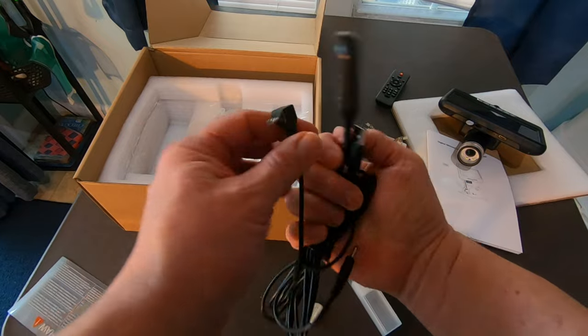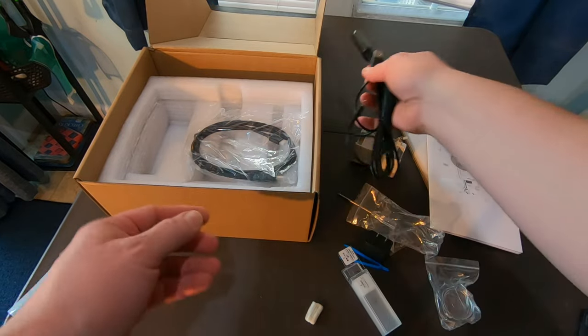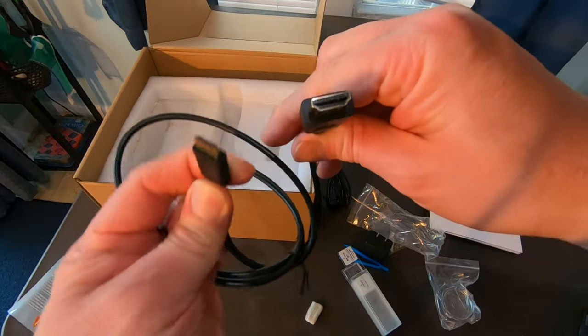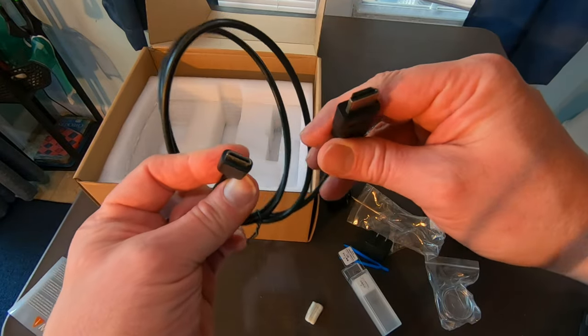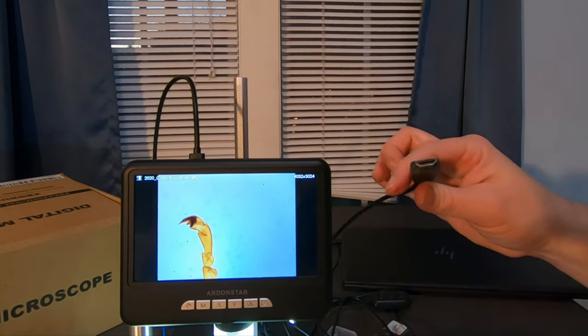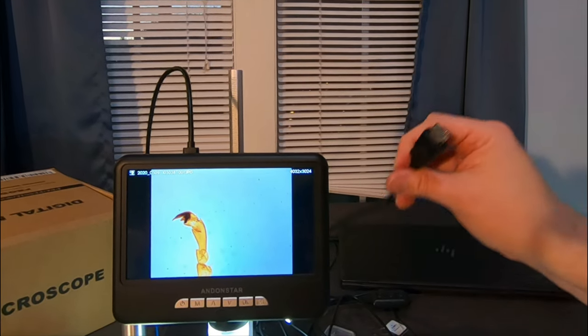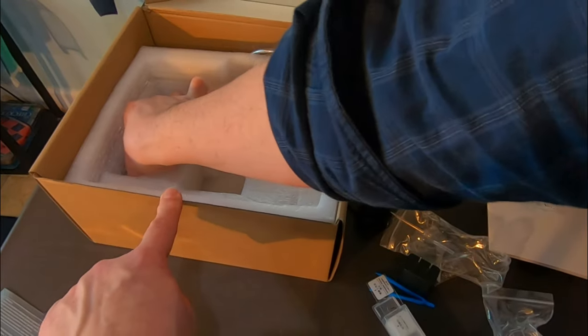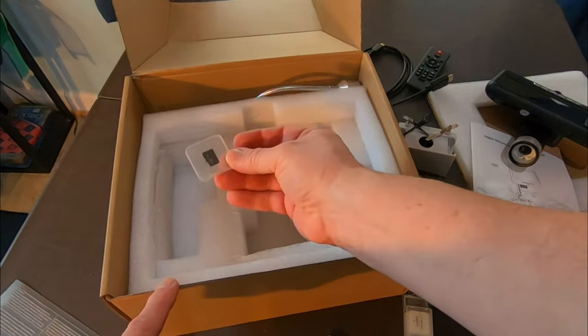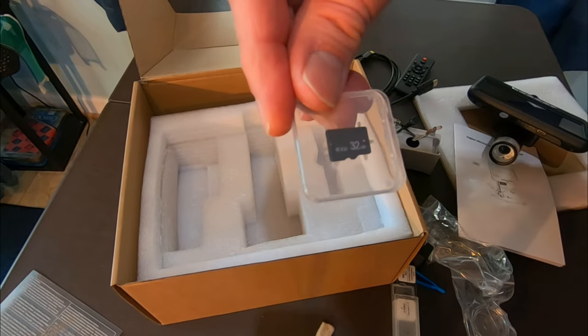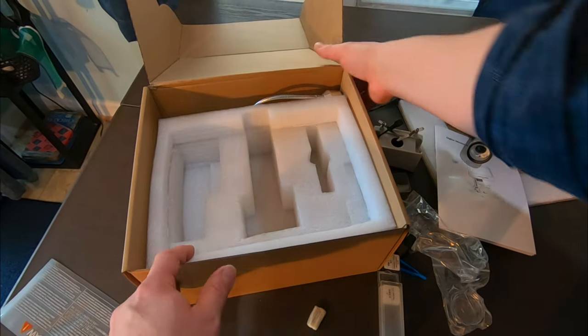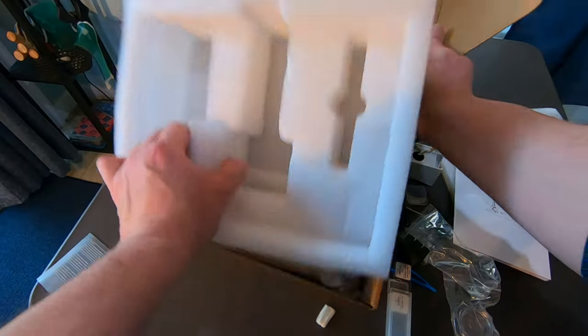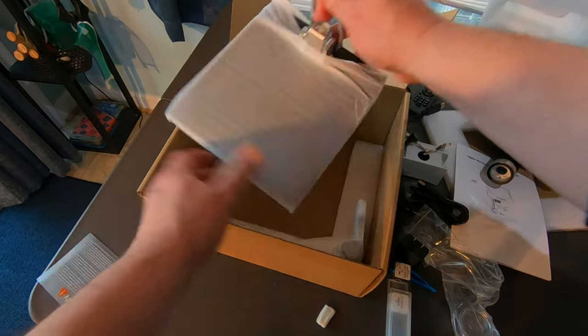Here are some additional control devices. Okay. Very important. All right. Mini HDMI to regular HDMI. I can also take my HDMI out and plug it into an external source to see it on an even bigger screen. So that's kind of cool. Oh, look at this. Guys. It even comes with an SD card. This is a 32 gigabyte SD card. Good. So it gives you everything you need to begin. You need to pick this out. Okay. And we have a mini USB. The USB.